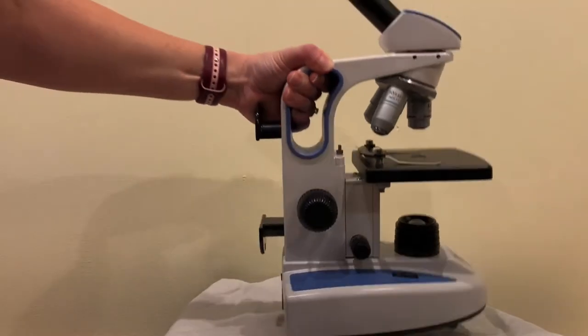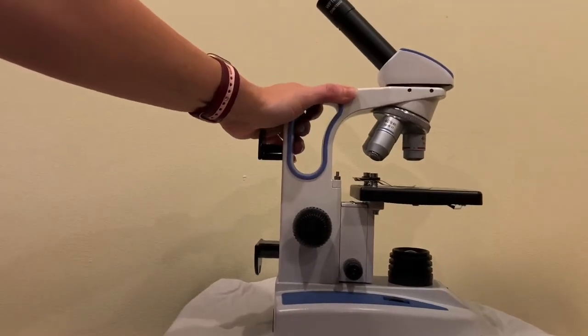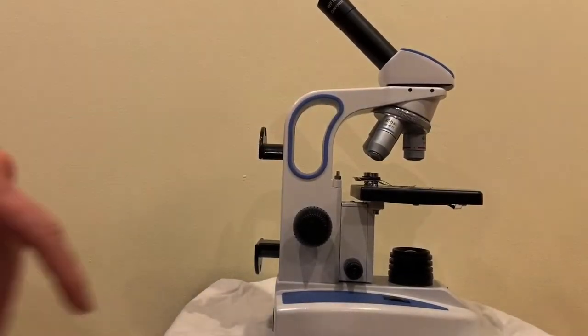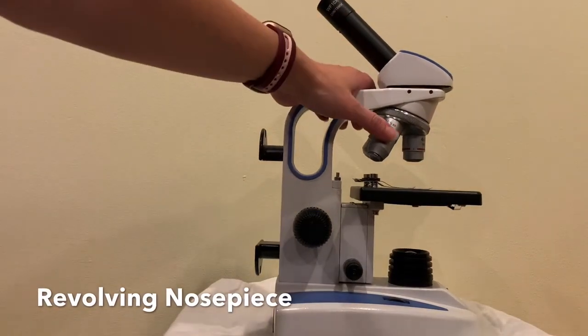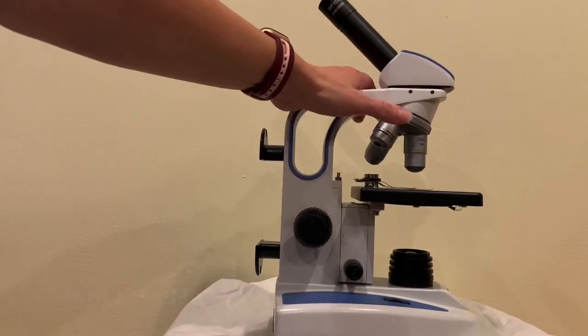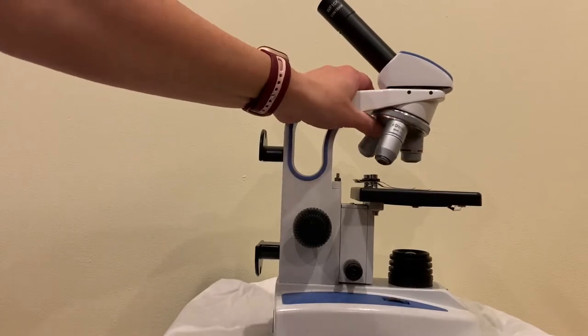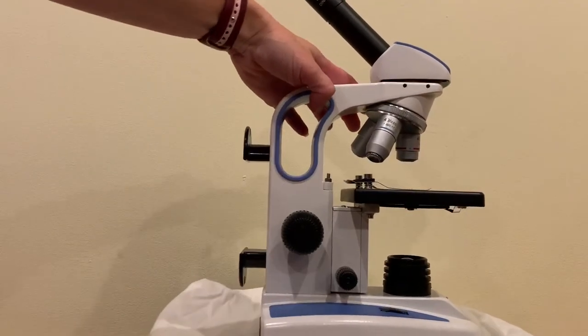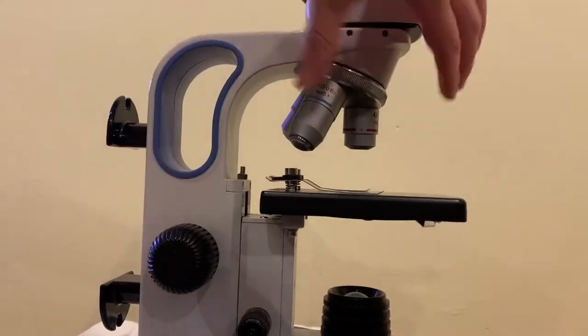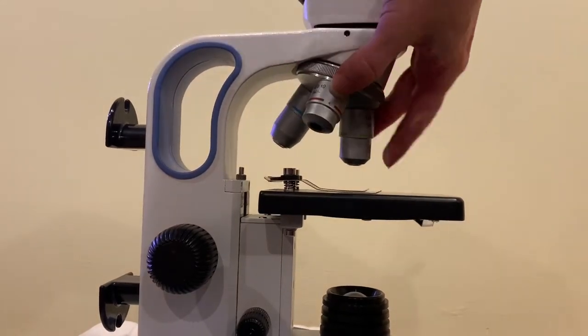The next part of our microscope is the revolving nose piece. Do you see why they might call it a revolving nose piece? It kind of looks like a nose. And it revolves here, right? It goes in a circle.